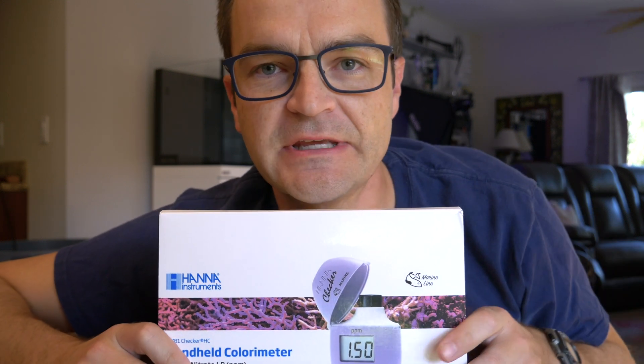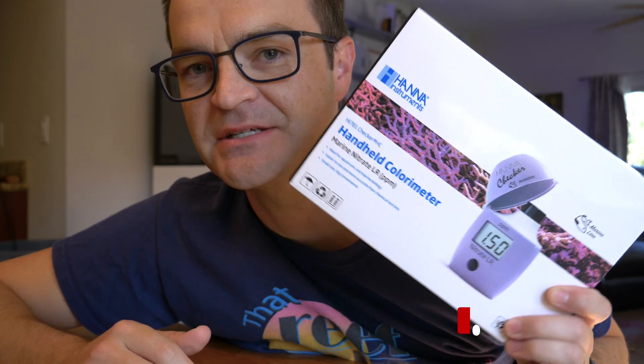All I ask is that you don't give this video a thumbs down because you don't like this new checker. I've watched three other videos on the new nitrate checker and let's just say there are more dislikes than likes.